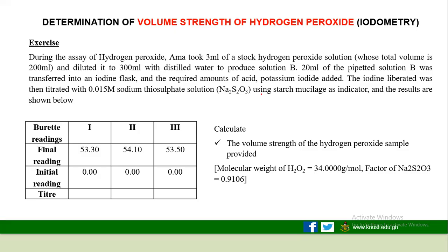The iodine liberated was then titrated with 0.015 molar sodium thiosulfate solution using starch mucilage as indicator, and the results are shown below.